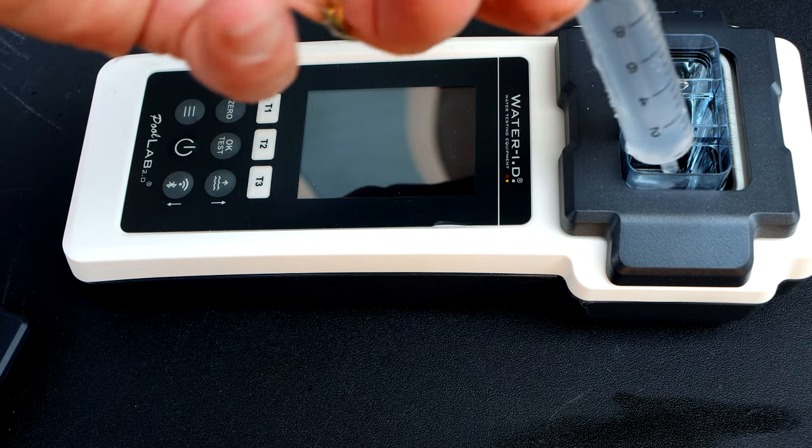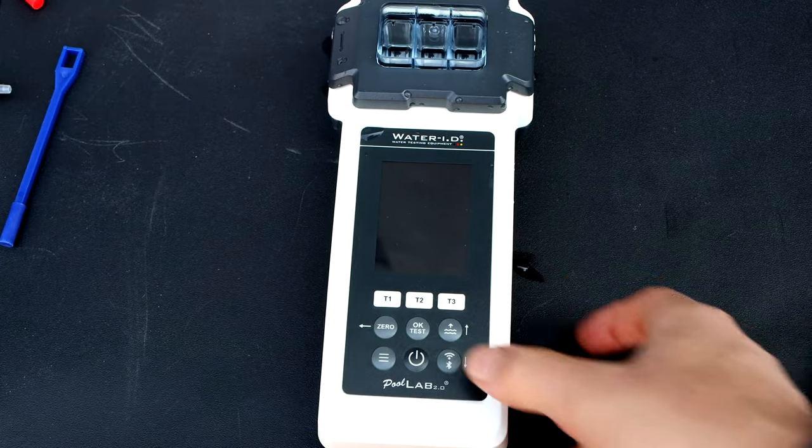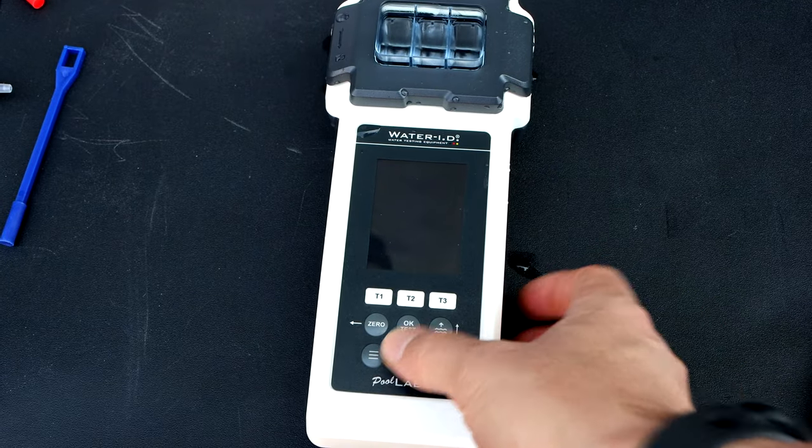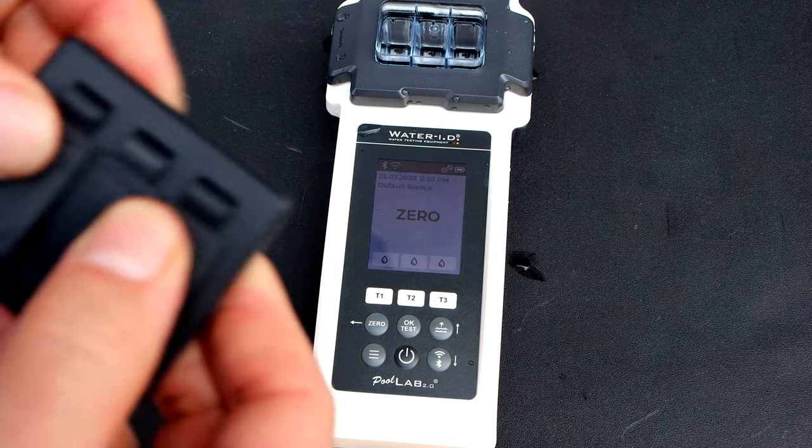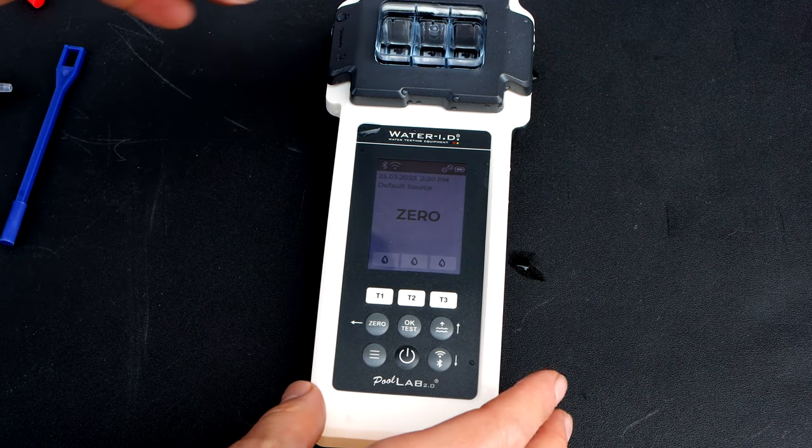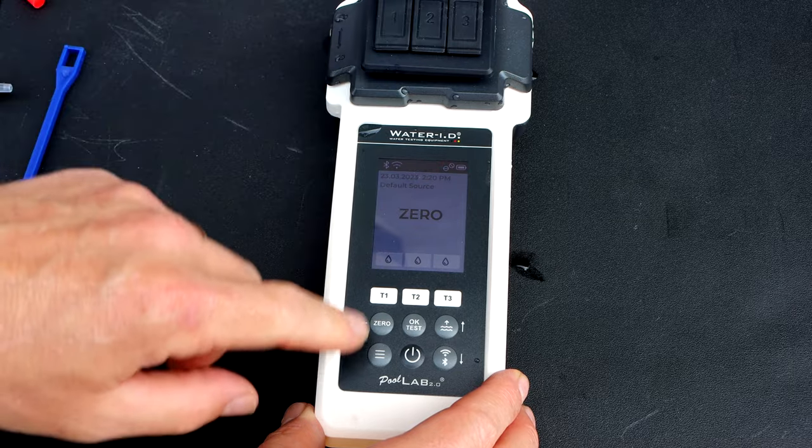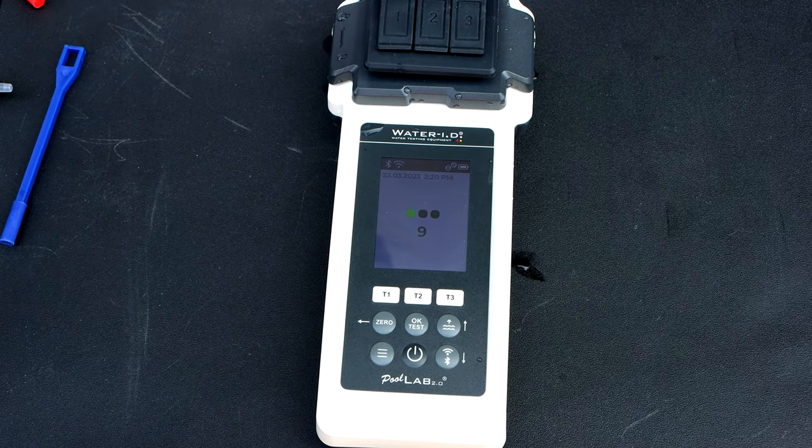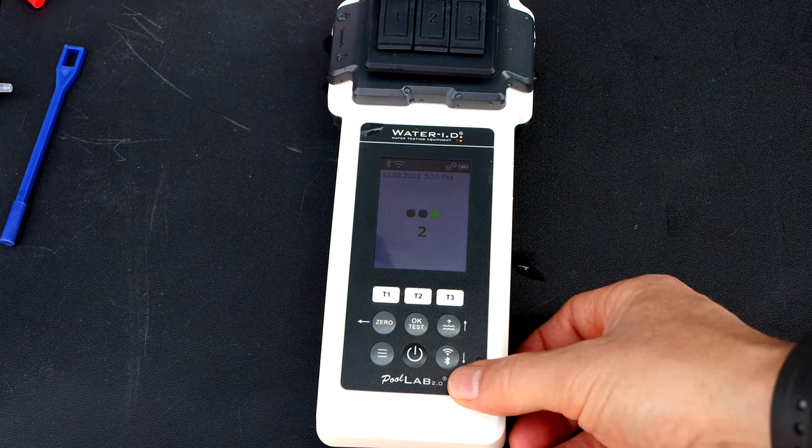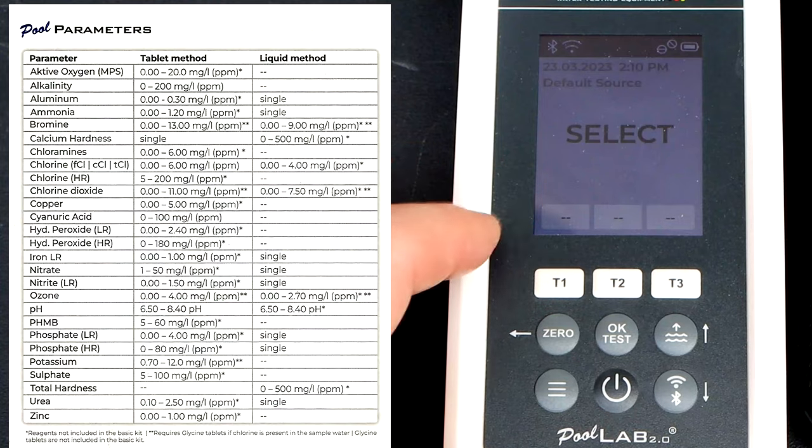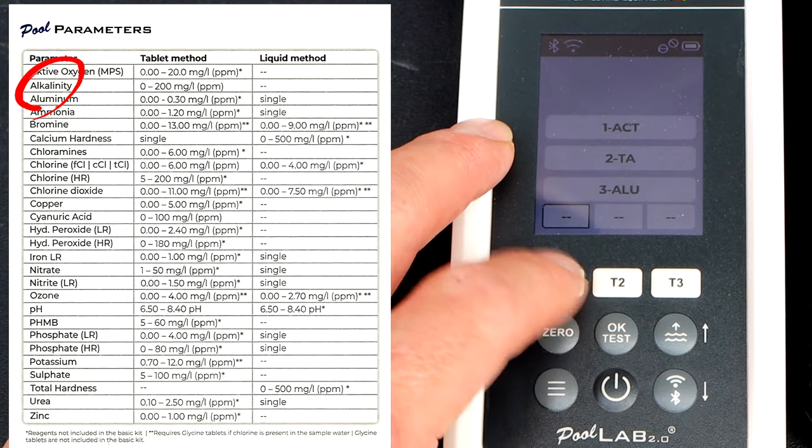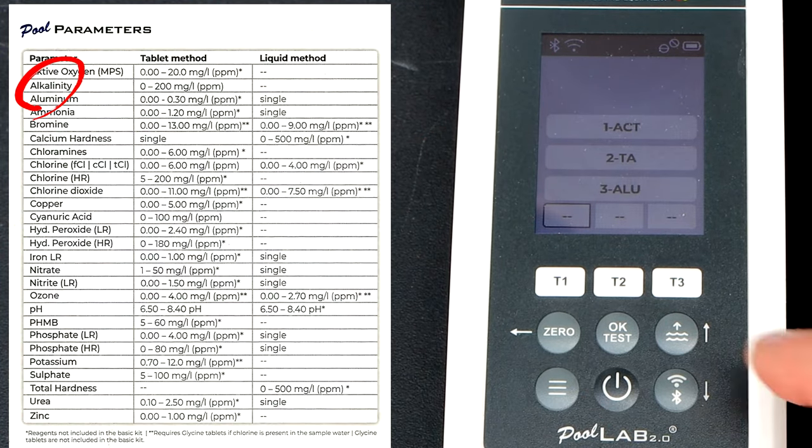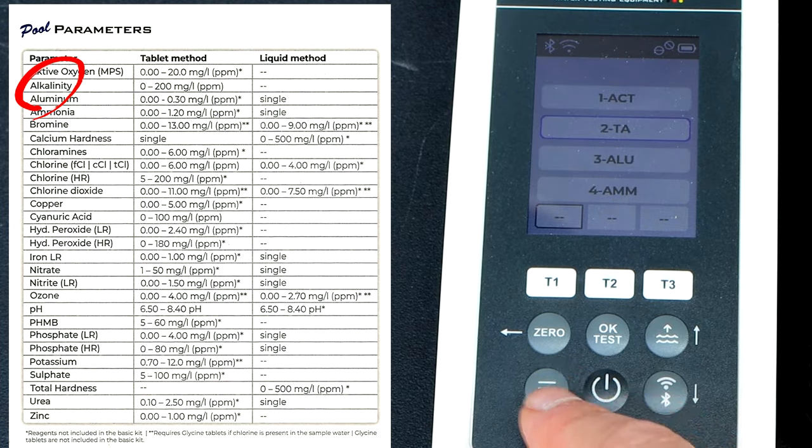You would just fill it up to the top and then fill up the chamber. I'm going to turn on the unit. Whenever you turn it on for the first time you want to zero it out. I'm going to do all three tests. Test one, I'm going to do the total alkalinity.